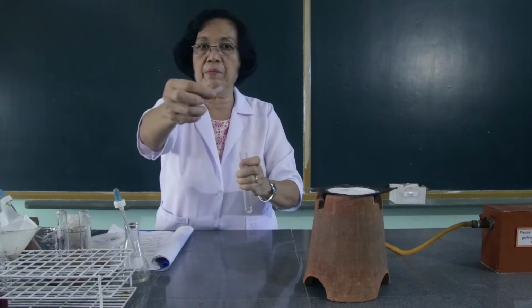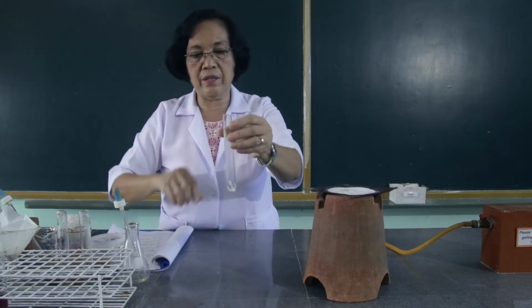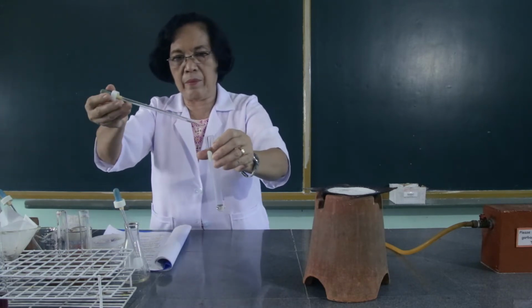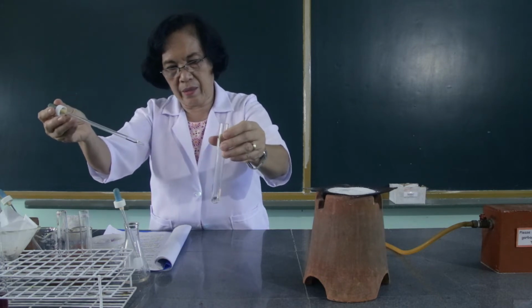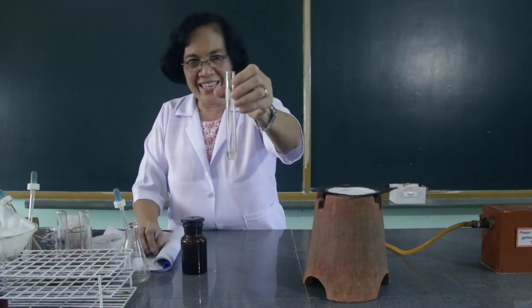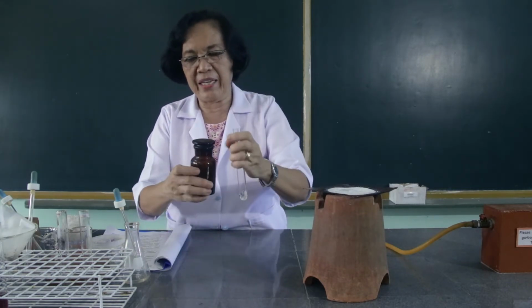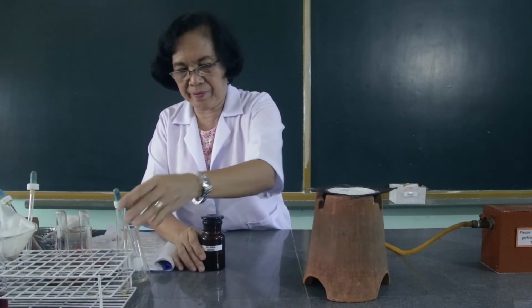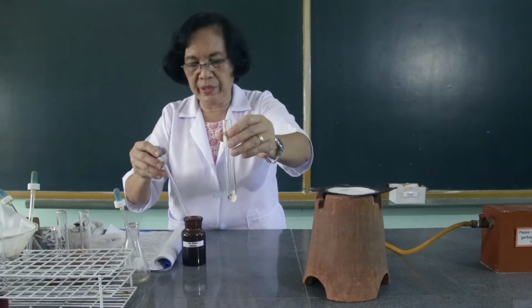So I have here the blue litmus paper. I'm going to place this down. And I will add this with the nitric acid. After adding this with the nitric acid, I'm going to add this with the silver nitrate solution. I want you to observe what happens.